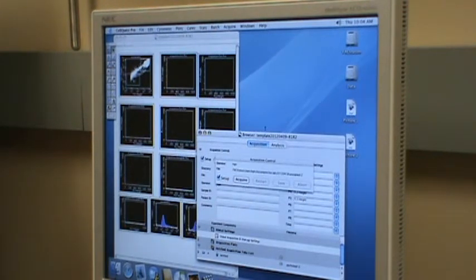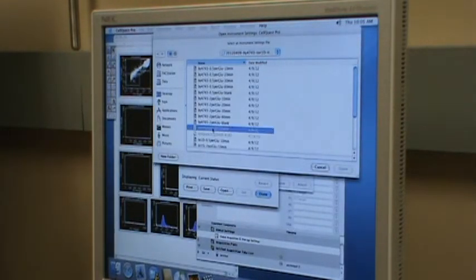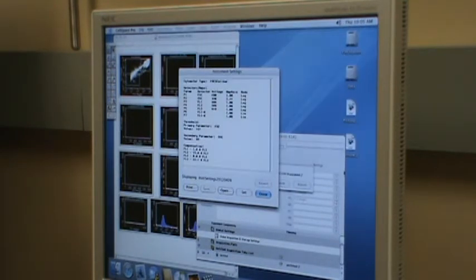instrument setting. So for instrument setting, we go to Cytometer, Instrument Settings, and then we say open instrument setting, put the instrument setting there, and then we say set. See the spinning wheel says it's setting the instrument, and then we say done.